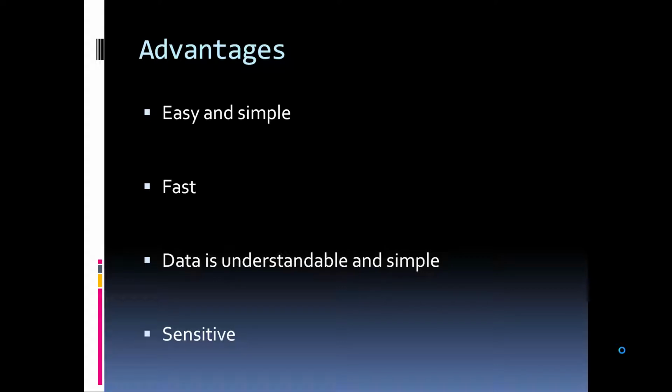The Bradford assay is also one of the fastest assays performed on proteins. The total time it takes to prepare and run the assay can be under 30 minutes, depending on how long the mixture incubates before reading. The linear graph acquired from the assay can be easily manipulated to determine the concentration of protein by using the slope of the linear regression of the data. The assay is also roughly 10 times more sensitive than comparable assays used to determine protein concentration.